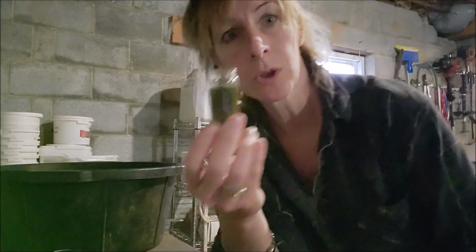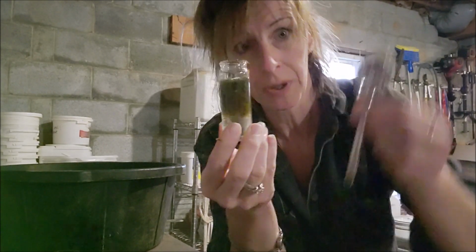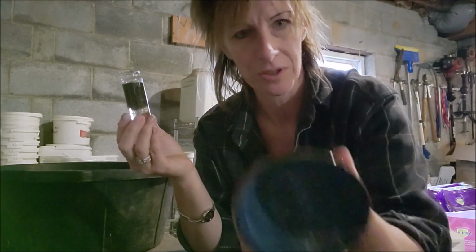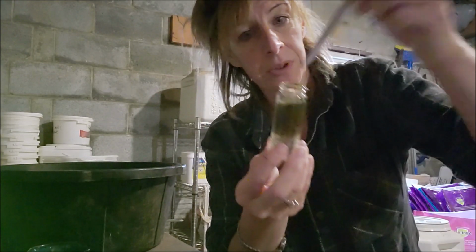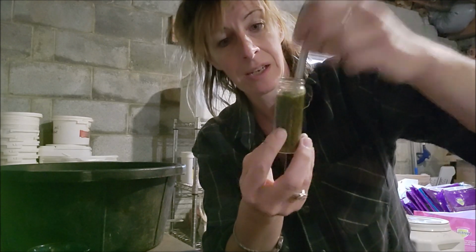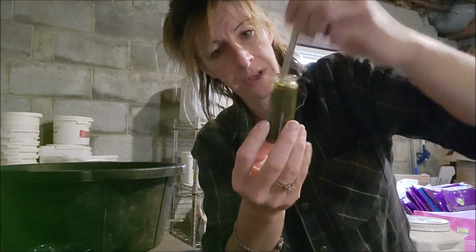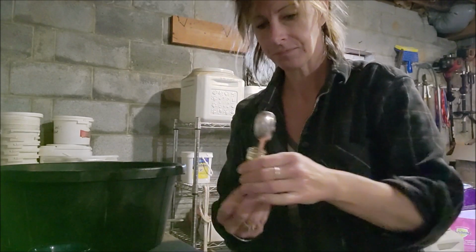Now, you could take this whole little blob and put it in a cup and stir it around. Easy enough, you could do it in here. This is what I'm using to dissolve his antibiotics in. But I'm going to do it in here because I like to mix it up in here. It's just much easier for me. So you want to mix it up really good, because what you're doing now is liquefying the fecal. Oh yeah, you don't need this anymore.